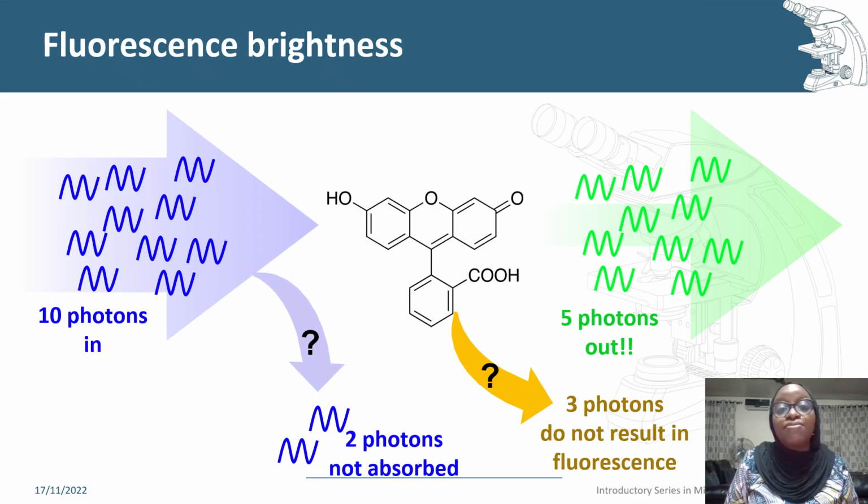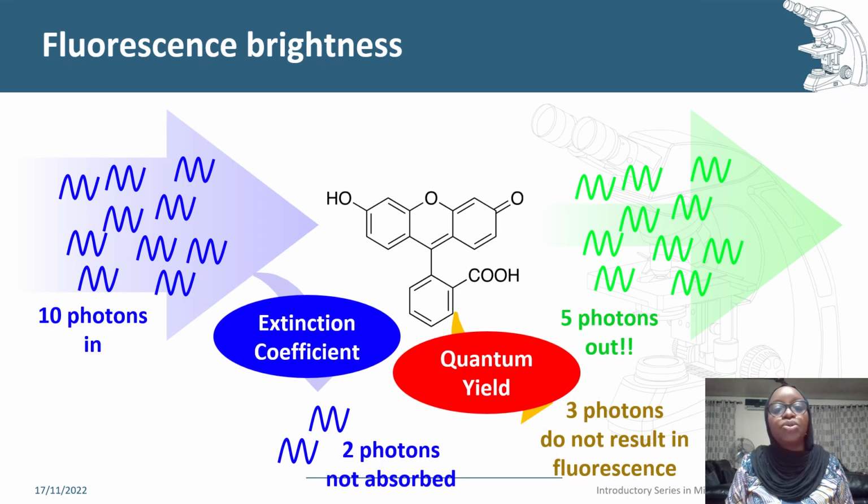Light is also a very important factor to consider when performing fluorescence microscopy on biological samples. We do not want to expose the sample to too much light, as it will eventually damage the sample. So what are these processes called?